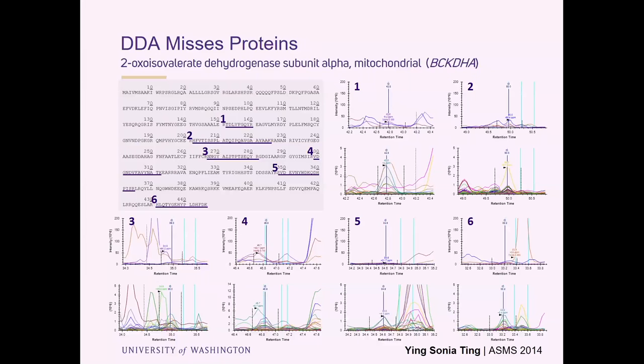If you look here, there are actually six separate peptides that Pecan showed for this. In each case I have the MS1 chromatograms and the MS2 chromatograms, and you'll see these are not cherry-picked. We have no library, so we're not picking the top three or top four fragments. We're using every b and y ion. If you look down here, there are about seven or eight really good co-varying chromatograms. Down here, there are about 10. Down here, there are several as well. Down here, there are lots of different co-varying chromatograms. But in most cases, there's no MS1 signal.